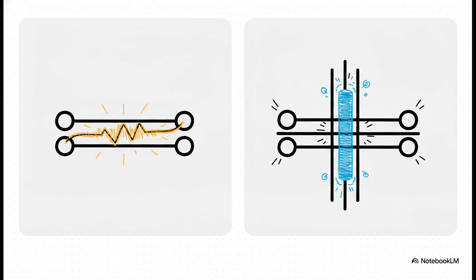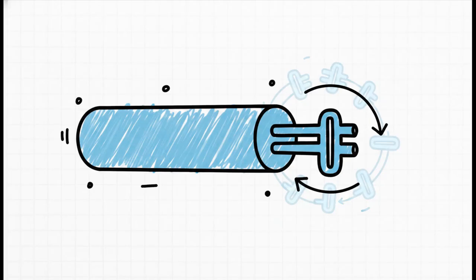So you have to wonder, why are triple bonds such incredible spin conductors compared to double bonds? Well, the secret is entirely in the geometry. An alkyne has a triple bond, right? Which means it has 2 pi bonds perpendicular to each other, creating a literal cylindrical pi system. Because this electron cloud is a complete cylinder around the carbon-carbon axis, the adjacent CH bond doesn't have to be locked into one perfect angle. Almost any rotational conformation of that adjacent CH bond is going to partially overlap with that cylindrical pi system. The telecommunication wire is essentially always connected, no matter how much the end groups are rotating.